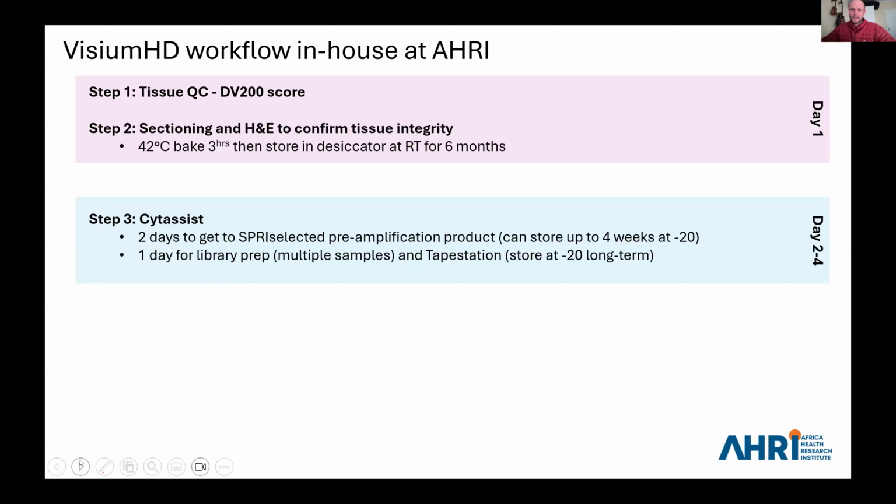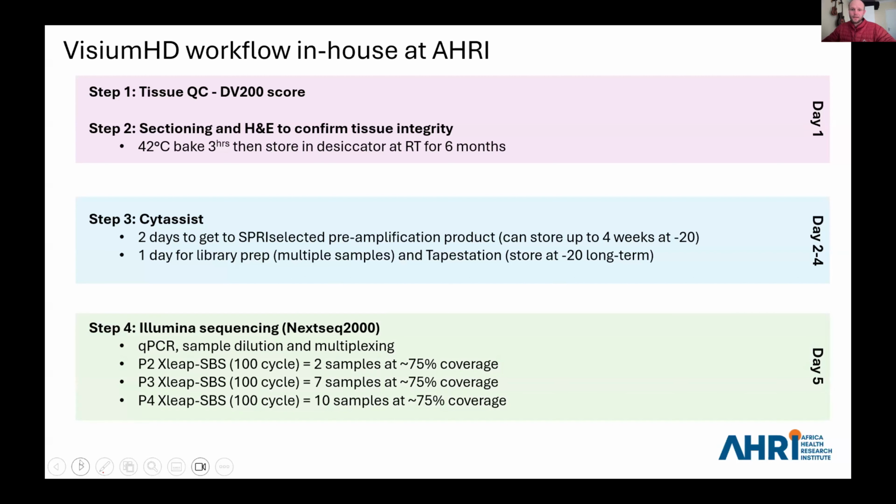So this generally takes us up to day 4 in our workflow. And then in theory, you can do your sequencing still in the same week. So for example, if we were to run only 2 samples, so a single Visium HD capture slide captures 2 samples, if you were to process that all the way to sequencing, you could do the entire workflow in 5 working days. So that is a comfortable workflow, and it is possible.